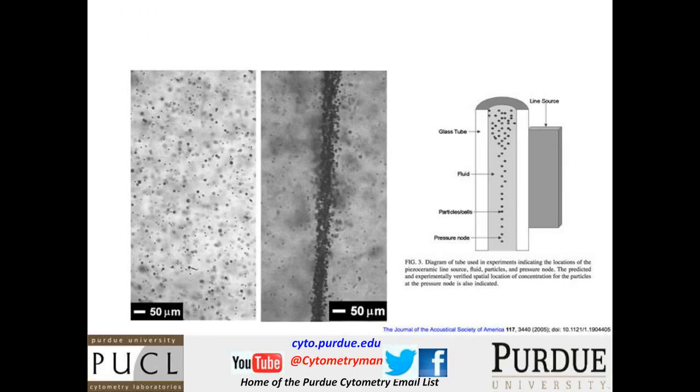And these are the pictures that he showed in his paper. So on the left here, you see before the acoustic device here was turned on, and on the right, you see the particles pretty much aligned in the center. And so this was the start of an idea.